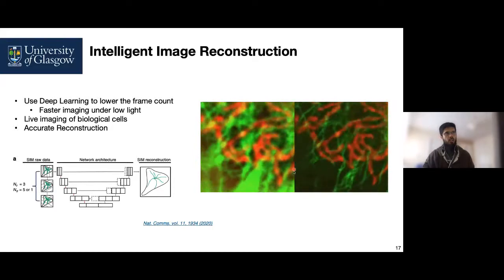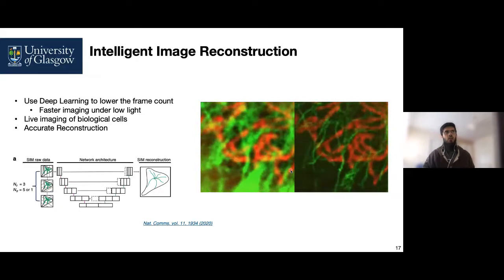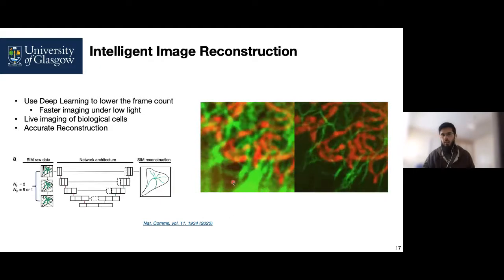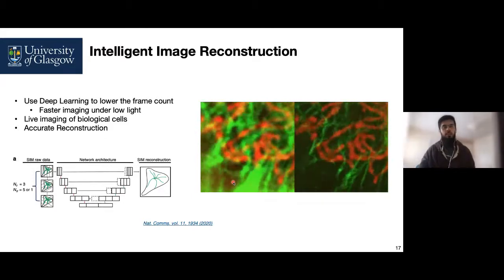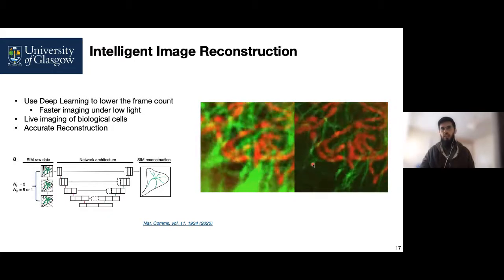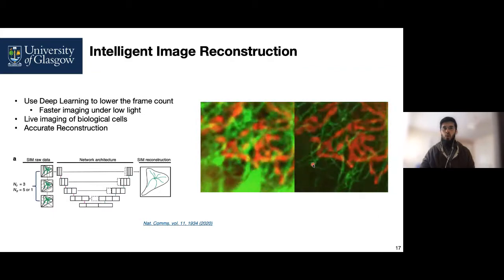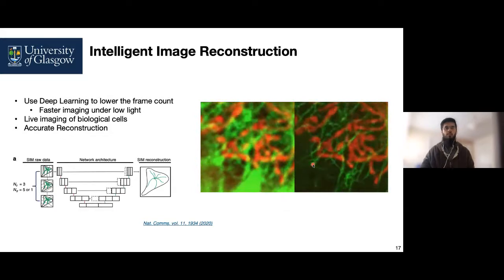The animated figure on the left that you see is what they would observe from conventional microscopy, and using their deep learning reconstruction algorithm, they were able to reconstruct and resolve much more detail in their images, not only in real time, but with far fewer recorded samples.